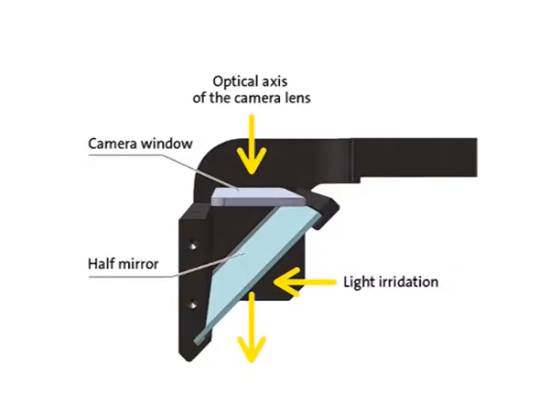Lamps may be used for examination from one side at one time or from both sides simultaneously. For visualizing invisible security features, coaxial light is used. This light is shone perpendicular onto the document.